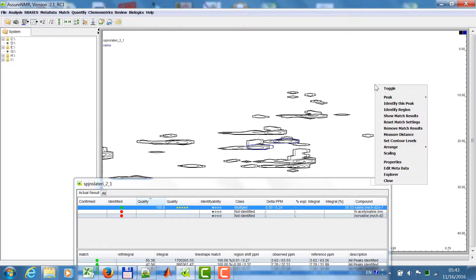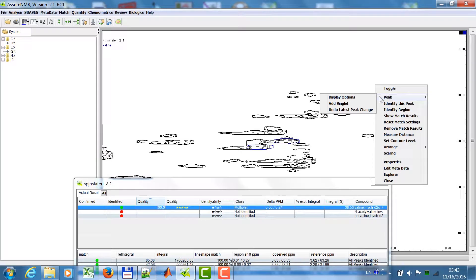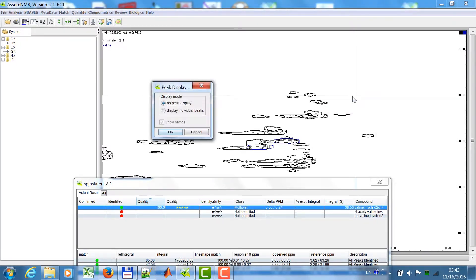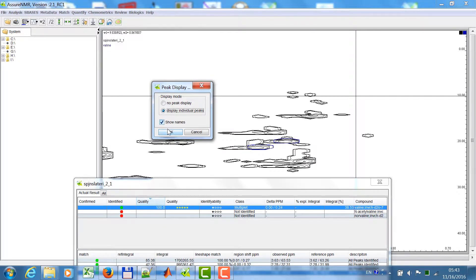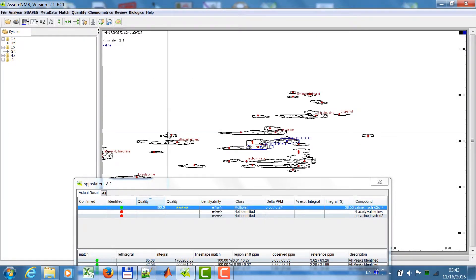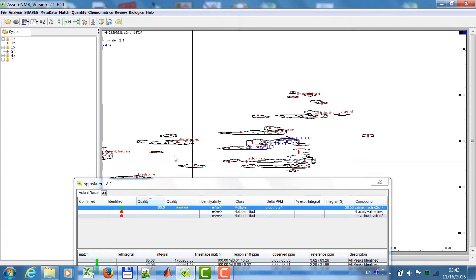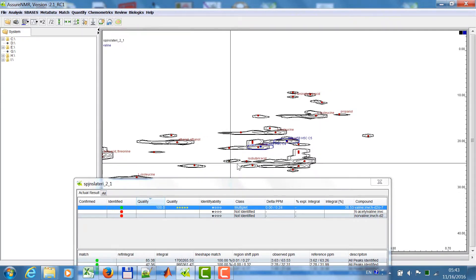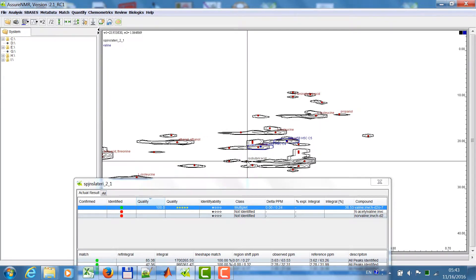With a right mouse click, I go to peak, display options. Now I want to see the peak list because the result is also an annotated peak list. You will see all the identified peaks with the name of the compound that was identified.